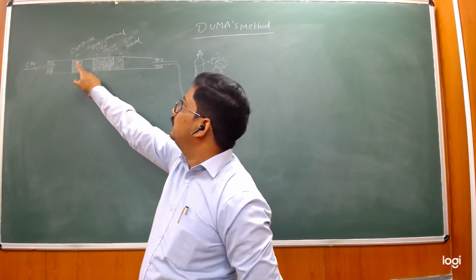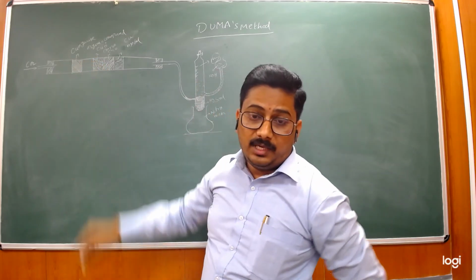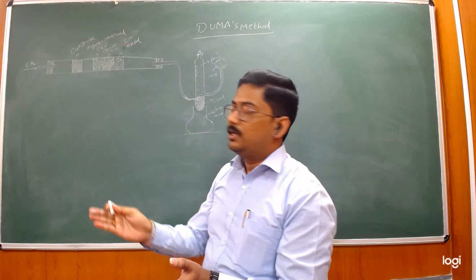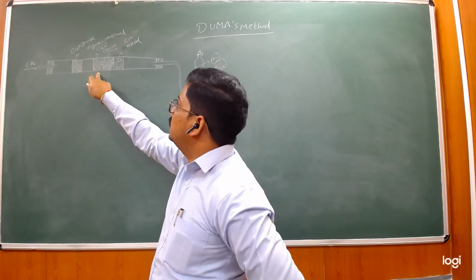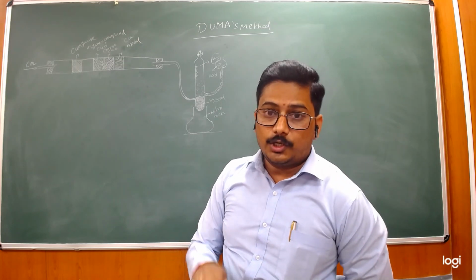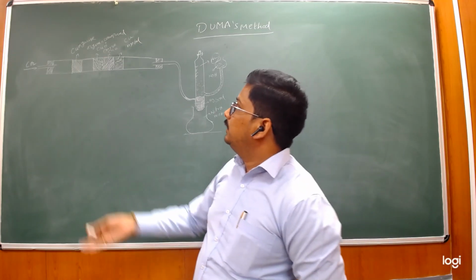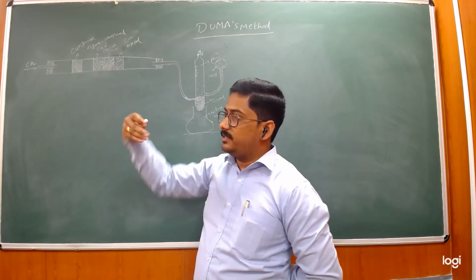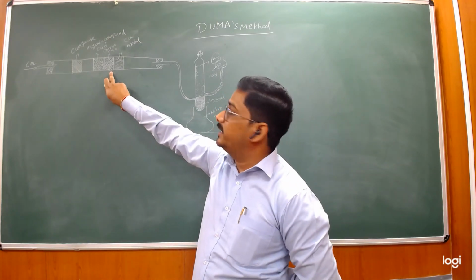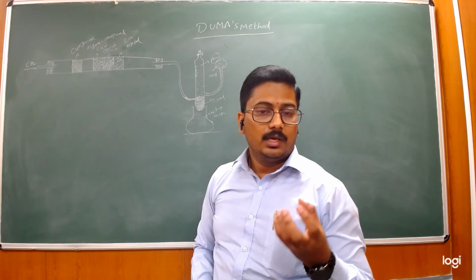The CuO gauze is used for uniform heating, and in the second chamber the organic compound and copper oxide are the reactants that produce the nitrogen gas. If any excess organic compound evaporates, it can react with the coarse CuO. Coarse means a rough surface of copper oxide.